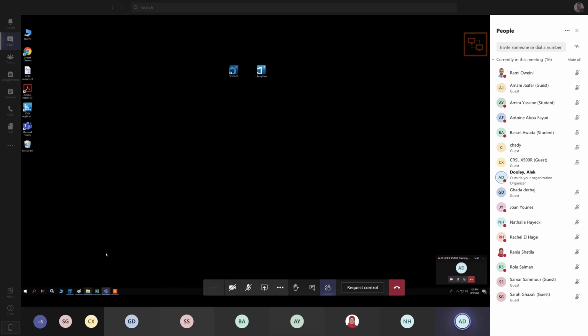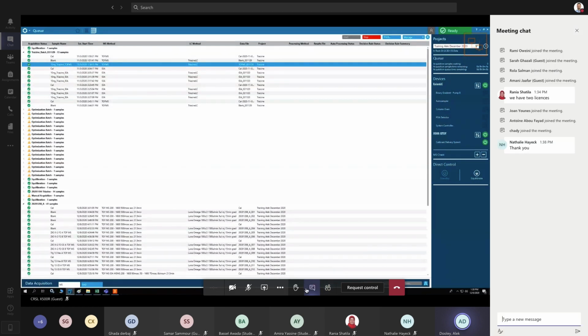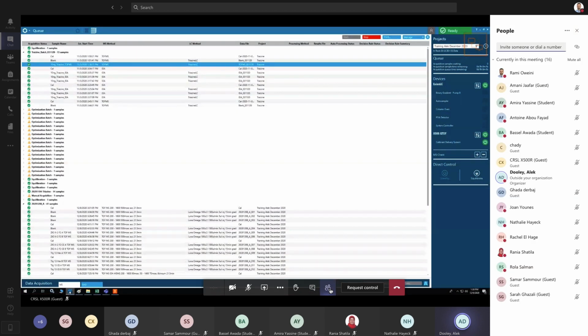Okay. So what I would like to do before we start is just to go over the batch again, if you don't mind, because we went through that very quickly because I had to leave a little bit early yesterday. And then we'll also take a look at the queue, and then we'll start looking at the data processing.